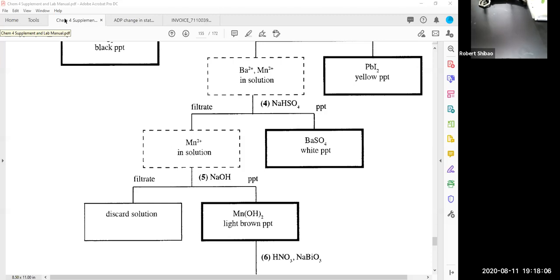What happens is this: people are trying to dissolve the crystals or trying to stir the mixture, and they keep tapping the bottom of this. As they keep tapping the bottom, it causes stress, because you're tapping it and you're pushing the bonds. And the bonds like to be at certain angles. For example, the tetrahedral angle is 109.5, but if you're tapping it, it either goes wider on one end and narrower on the other end. Well, that places a tremendous amount of stress on that bond and it weakens that bond. And so the bonds end up getting weak.